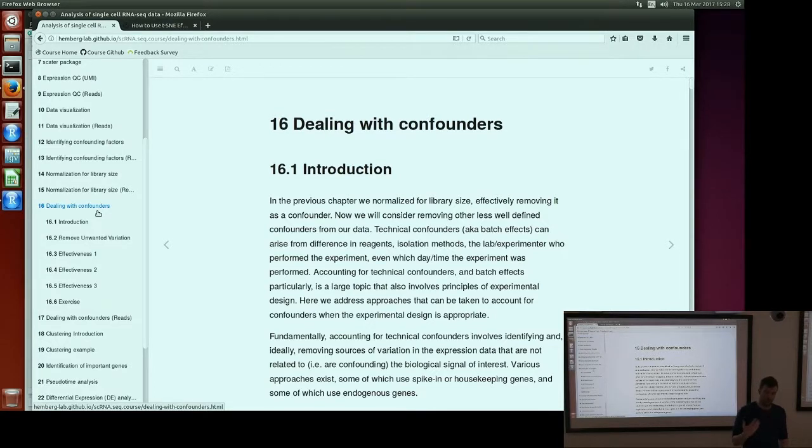So you hope that someone analyzing data, you or someone statistically minded, has had input into the study design to make sure that you're not in a situation where, say, batch is completely confounded with biological group, in which case no statistical trickery can save the day.